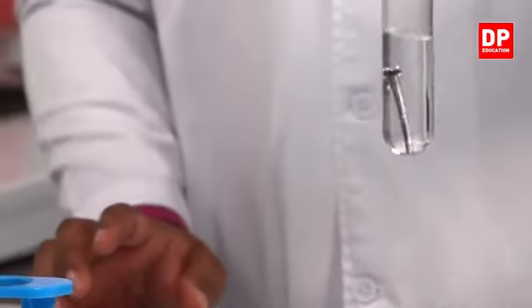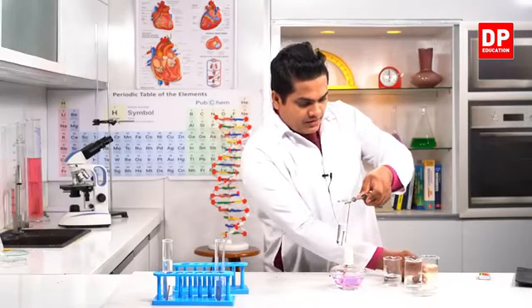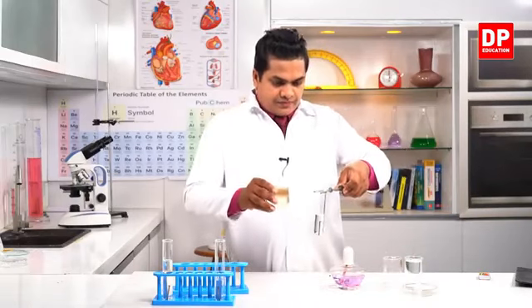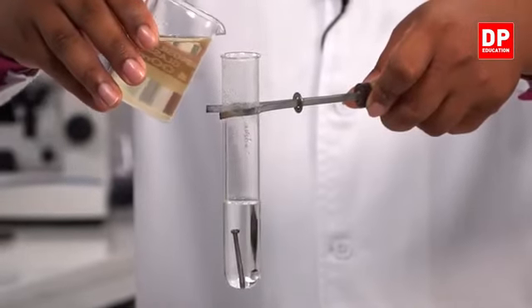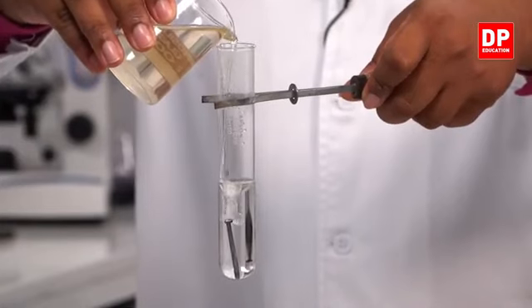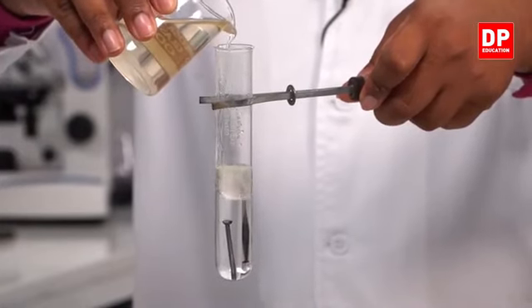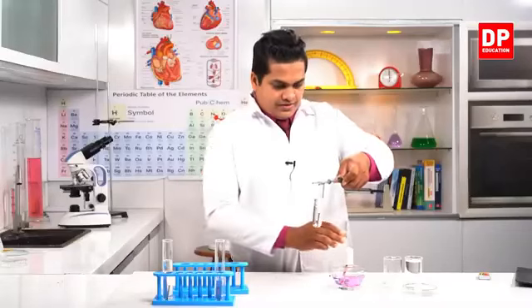Now let's keep it for some amount of time. Now we'll add the coconut oil into it. A good layer of coconut oil.